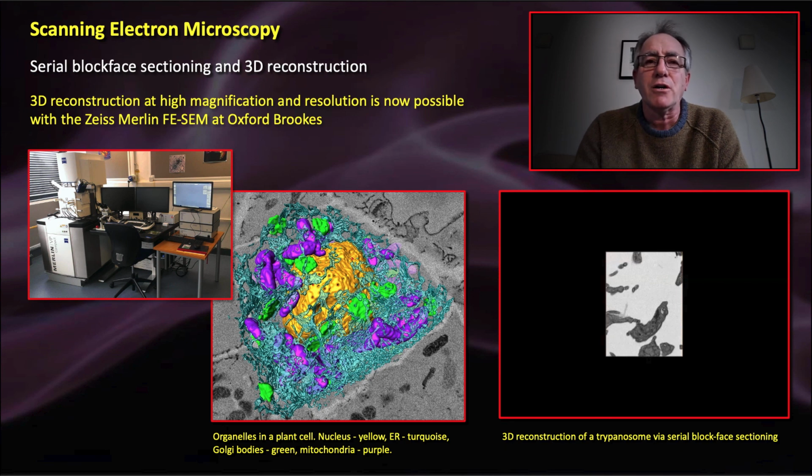I told you a while ago that the scanning electron microscope just makes images of the surface of a specimen.